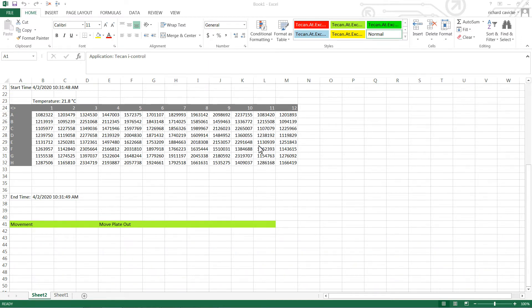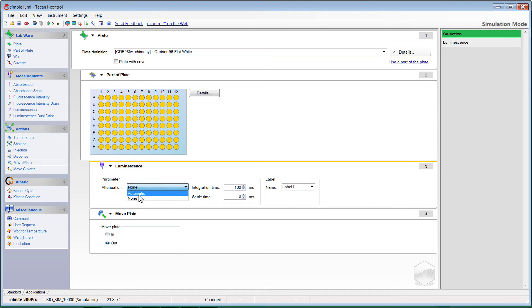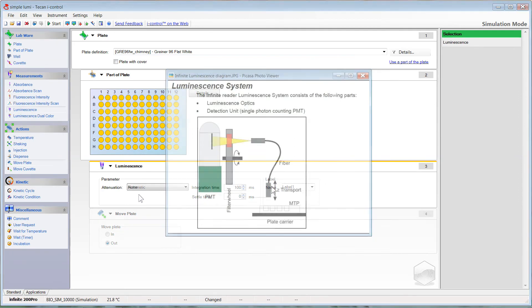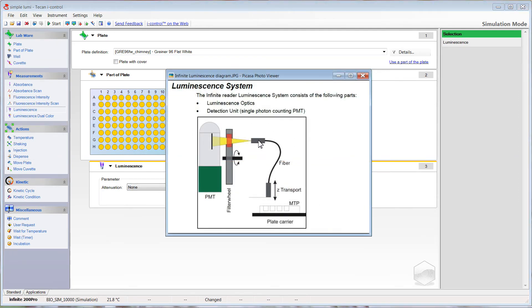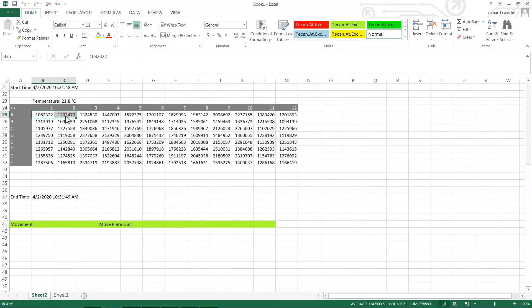What would happen if you were looking at this data and saw counts exceeding 10 million per well? In that instance we would invoke attenuation. By clicking here to select automatic, the reader will automatically look at each well, determine if its counts are above 10 million, and if so, it will rotate a 2 OD filter into the light path in front of the detector, reducing the amount of light reaching the detector by 100 times. It will then measure the signal, multiply the result by 100, and report that back out in your data. The software will highlight the wells where attenuation was applied.